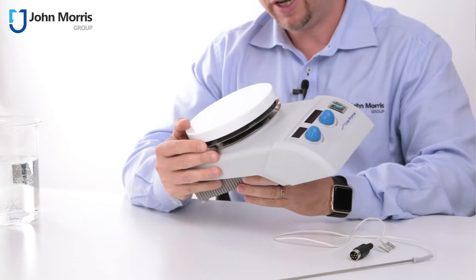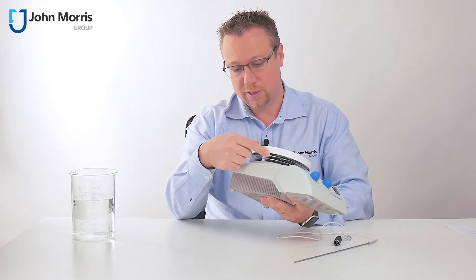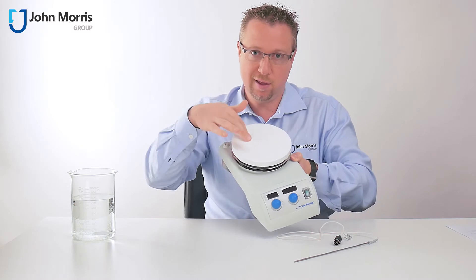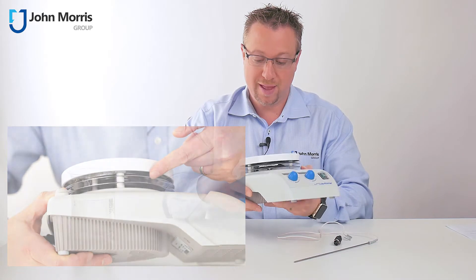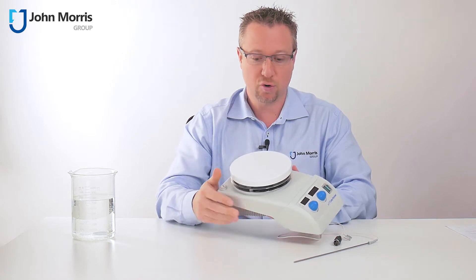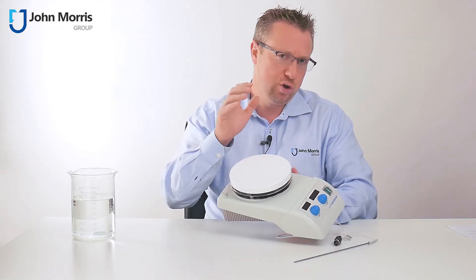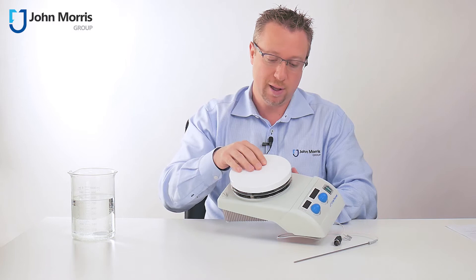First of all, this is a traditional hotplate magnetic stirrer. That means that inside here is a monophase motor which rotates, and at the top of the motor you have a block with two magnets, and the magnets rotate underneath here and they create a moving north and south pole. That's different from an induction hotplate magnetic stirrer, which creates a changing magnetic field by pulses of electromagnets. Those are usually more expensive and can be stronger and have their own advantages, but this is a great traditional hotplate magnetic stirrer.